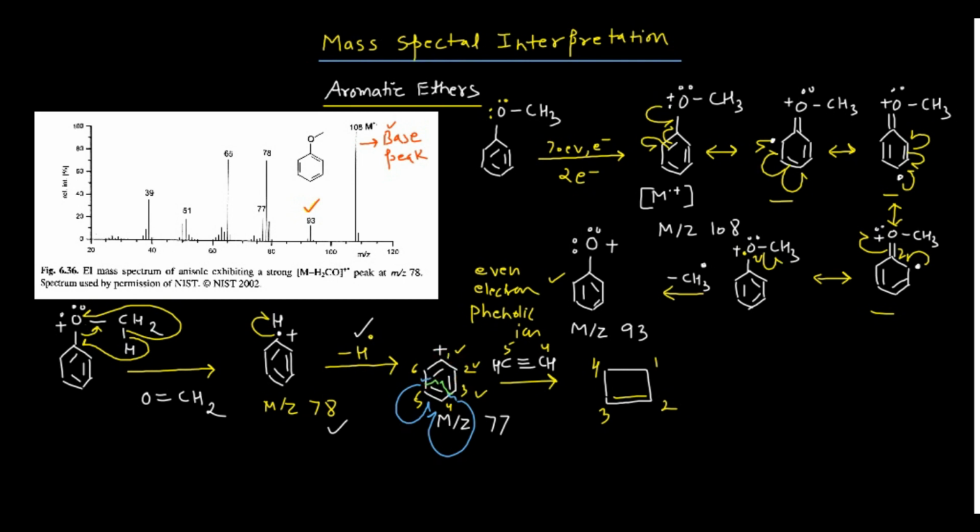I want to remove this 4 as well, and instead of 4, I'll write 6 here. Now it is quite clear: 1, 6, 2, 3. So there is a double bond between 2 and 3 and a double bond between 1 and 6.